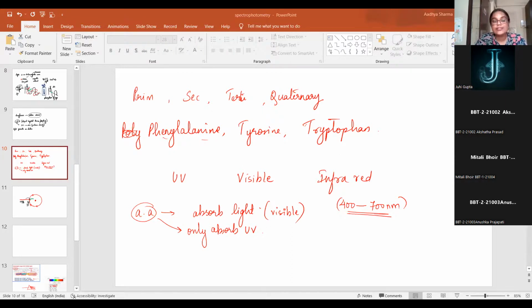These techniques work on some form of energy. In spectroscopy, you are using light as a form of energy. In nuclear magnetic resonance, you are using radio frequency. That radio frequency will hit the matter, and the matter will also start resonating with it. The matter will either get excited by taking the energy, or come down to the ground state and emit energy.